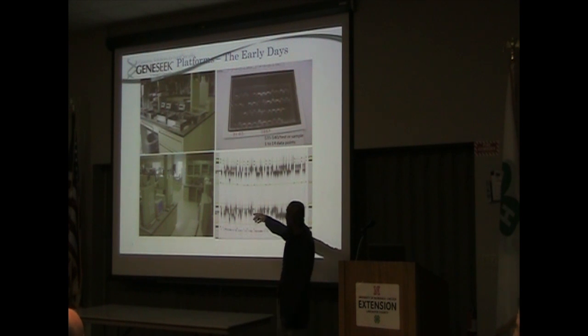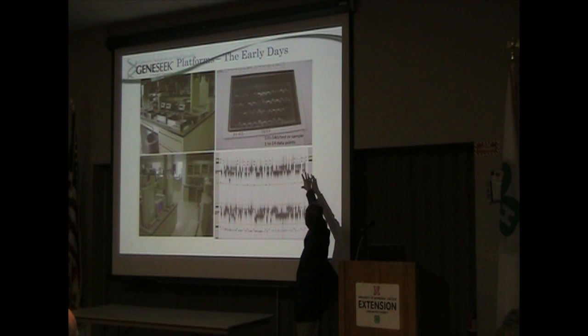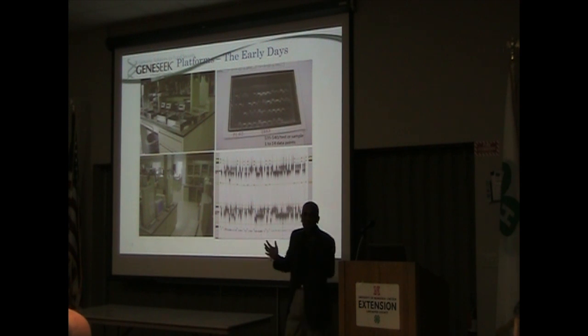I used to work there. Those machines in the old days, about 10 years ago, pictures of all the machines clustered together in the company. What that data looks like, these are known as microsatellite markers. If any of you have done parentage on cattle, these would be the markers you would have used. Okay. So again, I hope I'm making some sense to you.